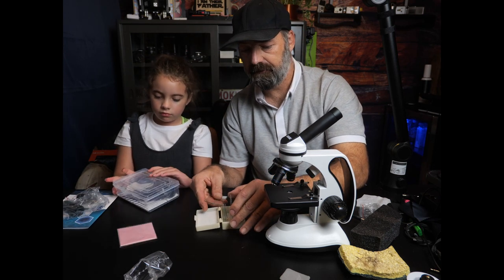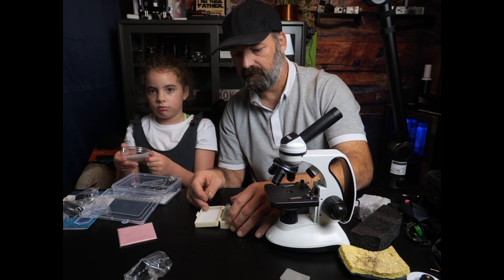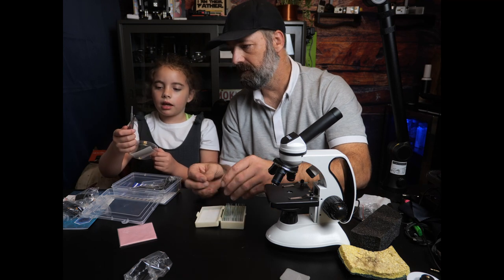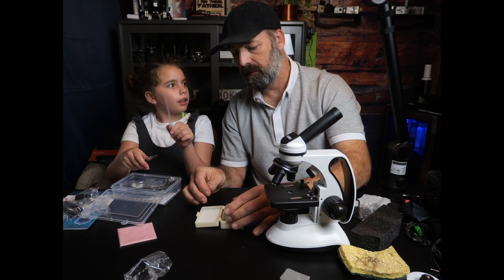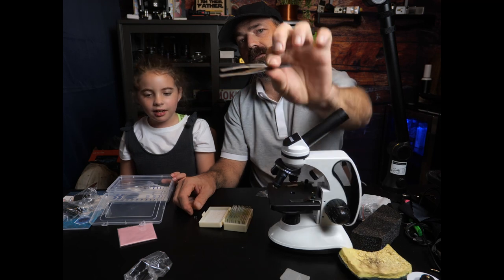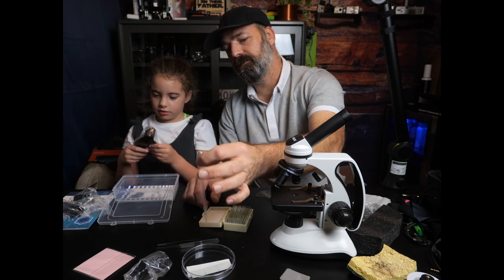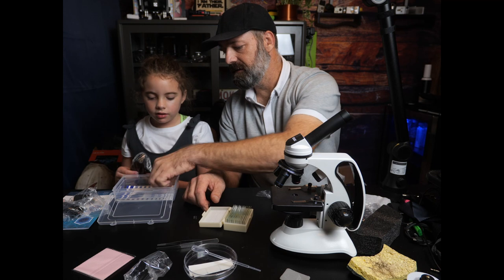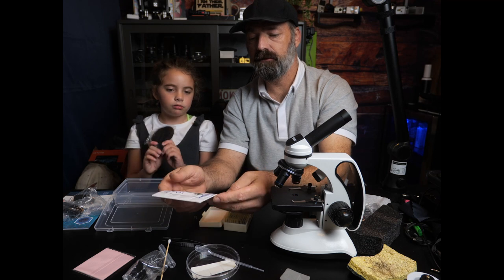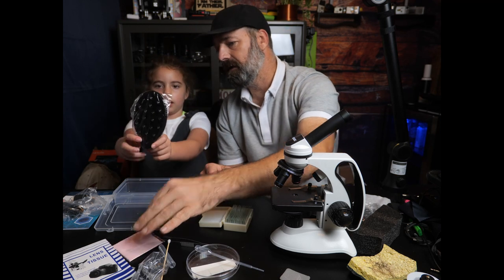Go ahead and open that box and see what's in there. Oh, that's a petri dish — remember, that's what you put the gel in and you touch it and it'll grow like bacteria or fungi, and then you can look at it under the microscope. And this is like where you can suck up stuff and put it under the microscope. This is tweezers so you can pick up small things. You have a little bulb for sucking up fluids to put samples onto your slides, a little test tube and stirring stick for taking samples, and tissues for cleaning your lenses.